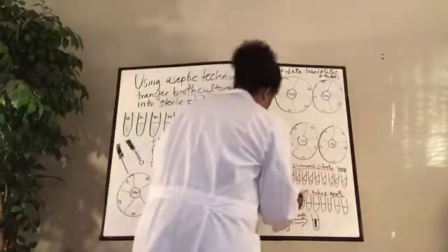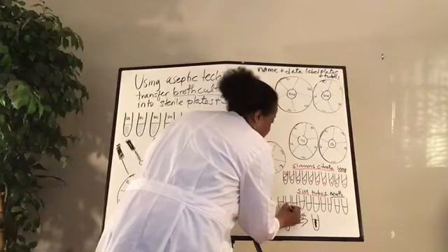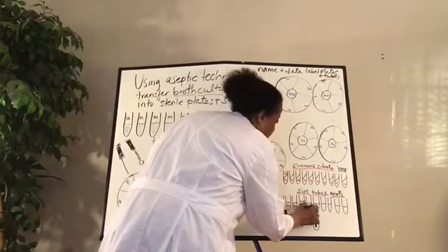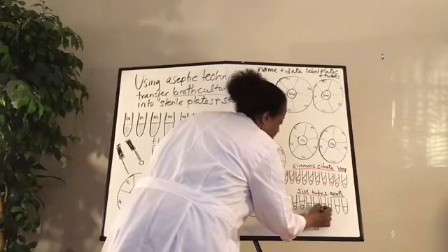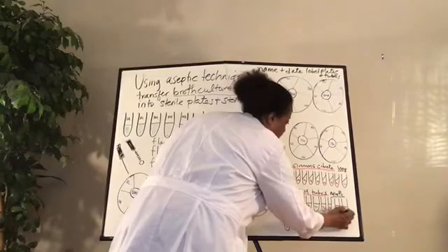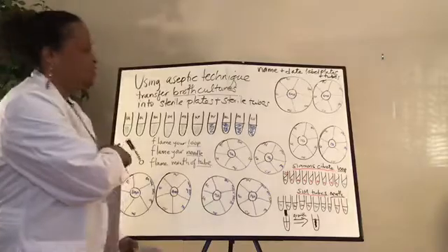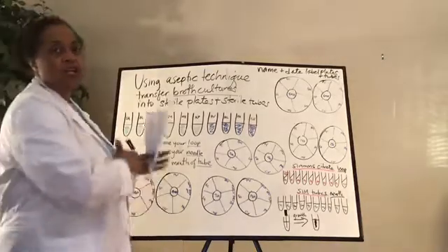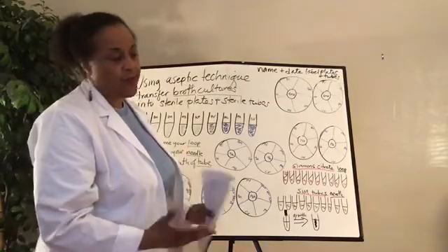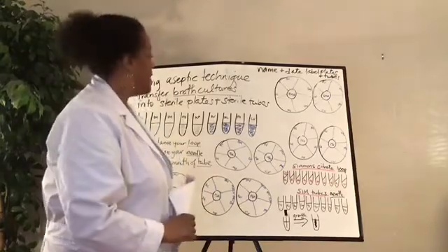Let's go on and label them the same as this. SA, EC, BM, SM, MS, KP, PV, ML, PA, CV, right? And that should be really great with your labeling. Spread these things out on sheets of paper. You got a lot of paper, so just use it because we haven't been using it in the lab, so you might as well just go on and use it.